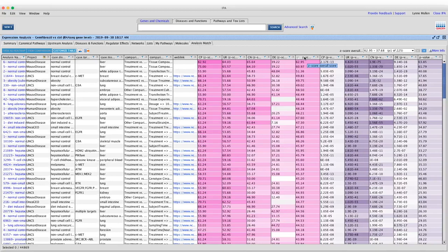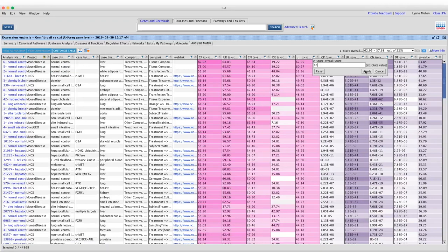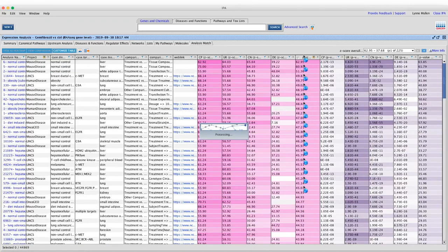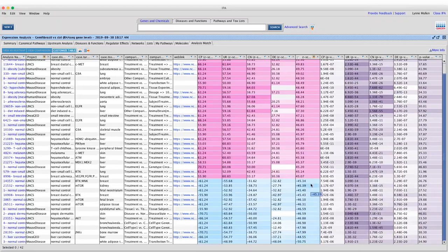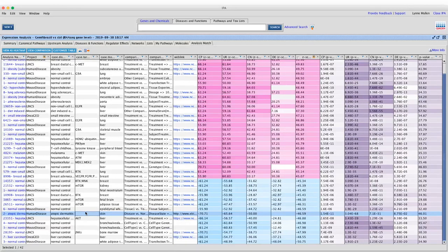To understand what's driving the matches, you can select results and view them as a heat map to get more detail. In this heat map, our analysis is shown in pink and all other matches and anti-matches are in columns. Using hierarchical clustering, we can see that white adipose tissue treated with rosiglitazone — also a PPAR-gamma agonist — is very closely related to our gemfibrozil-treated analysis. The most different ones involve untreated white adipose tissue. A dendrogram shows which analyses are most closely related, with PPAR-alpha and other PPAR agonist drugs appearing prominently.